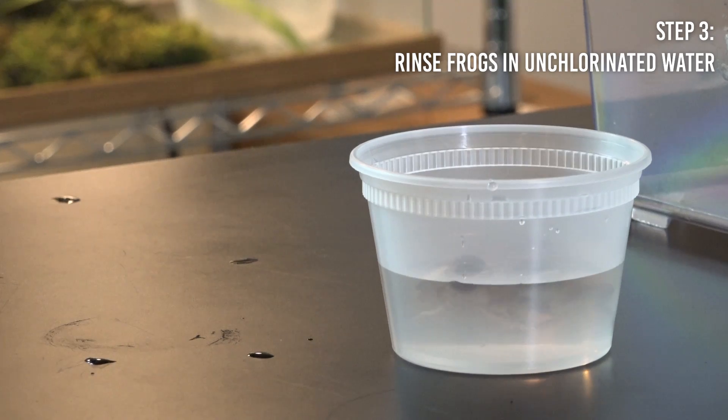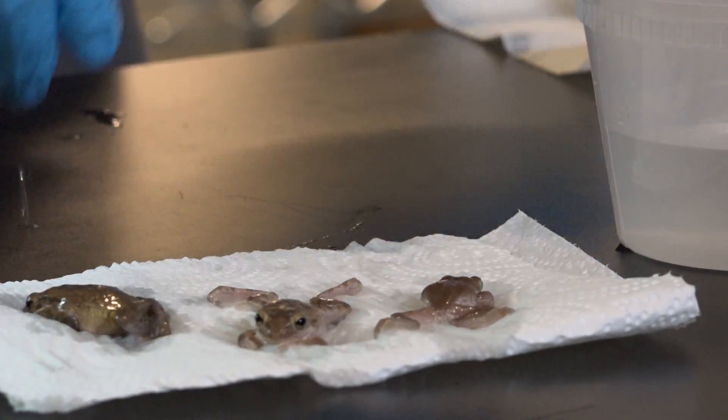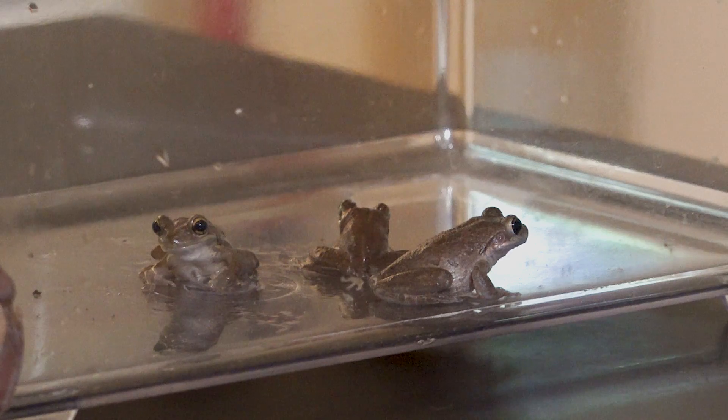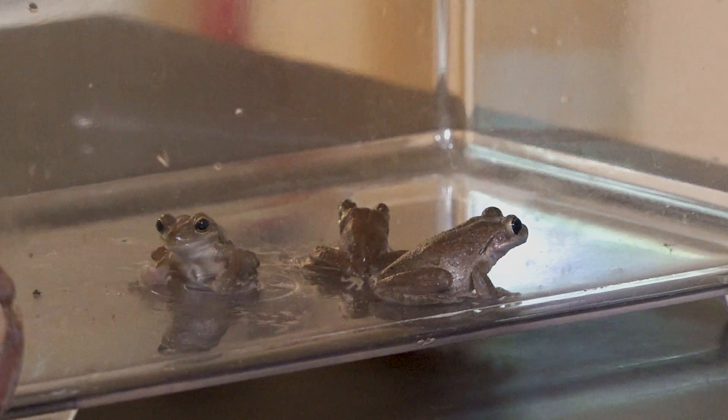The gene that we are going to inject today is called folistatin. What folistatin does is it down-regulates a gene called myostatin, which inhibits muscle growth. If we were making muscles all the time, we would burn so many calories and our bodies would have a hard time existing. But when you give a gene therapy that makes myostatin not work so well, you grow muscle.